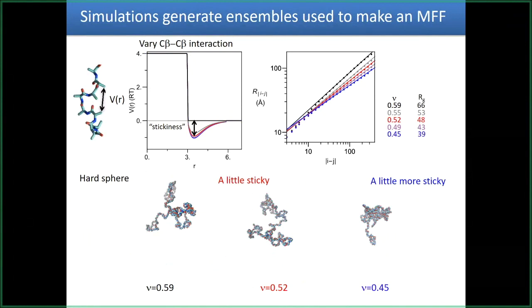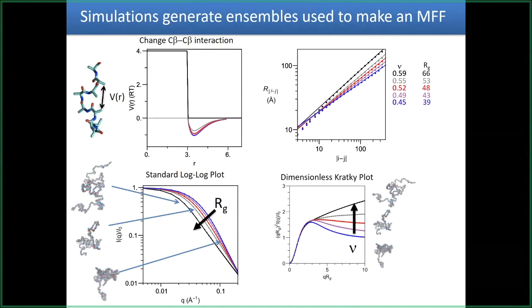It turns out a lot of people have models. Nobody's played the whole game where you just tune things and get the molecular form factor like we did. But the idea is that you can just take an ensemble, whether it's a detailed all-atom MD simulation or just a single C alpha model. For this level of resolution, they're both adequate.